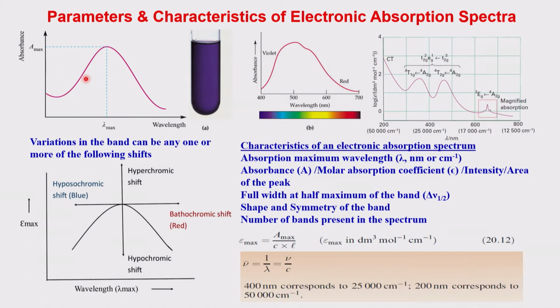That is basically a machine learning kind of thing. This is what the machine has given, and then we have to try to understand that spectrum in terms of chemical information. So we are basically doing a machine learning process, decoding what we get into chemically meaningful information, the spectra to the chemically meaningful.